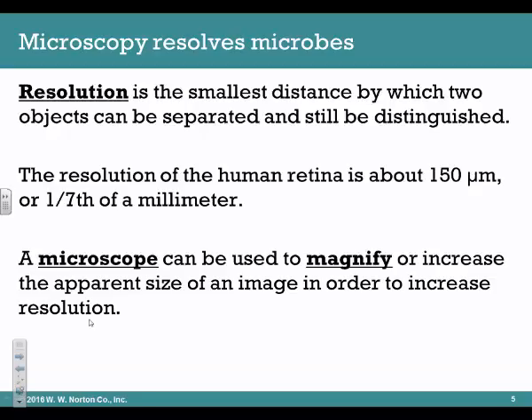So microscopy helps us to view these microbes and microorganisms, and that's how we're going to use the microscope in lab in order to do such activity. And really the way that a microscope helps us to see such tiny organisms is that it has 3 variables. First, it makes things look bigger, so it magnifies them.